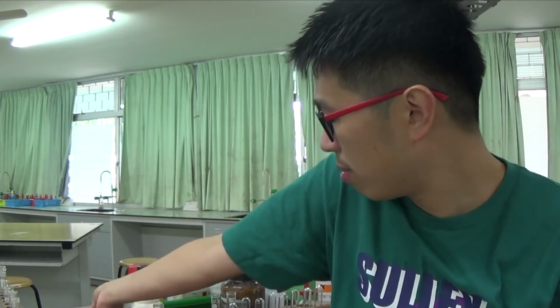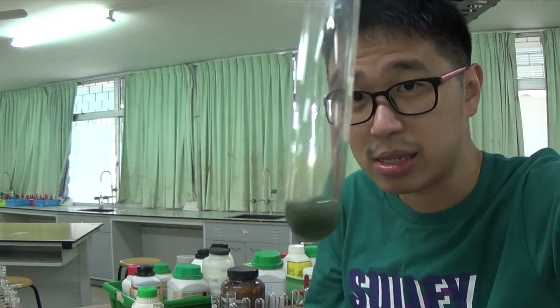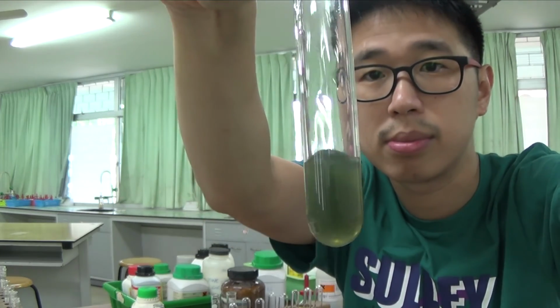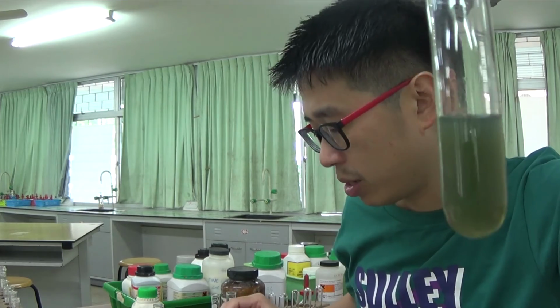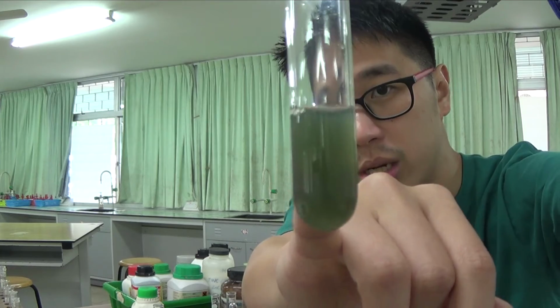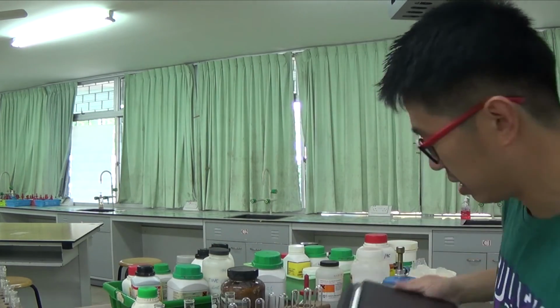So I get a green precipitate. I added almost an equal amount, so I'm going to add excess now. Adding excess, let's see what happened. Do you get a precipitate? Yes, the precipitate remains, because as you can see, this is not a solution. You can shake. It is not see-through because this is a precipitate. So you get a dirty green precipitate, which is insoluble in excess.